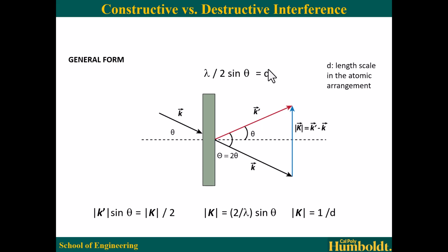So for example, let's see if I can write on here. Yes, great. In crystalline materials, we know there is this distance, and that distance repeats everywhere. But if I have an amorphous material, there might be some nearest neighbor distance, but then if you're looking for characteristics, it gets kind of fuzzy. So instead of having just a sharp peak at that particular distance, there may be several distances here that are kind of the same characteristic size. So you may get a peak that has a certain width to it.